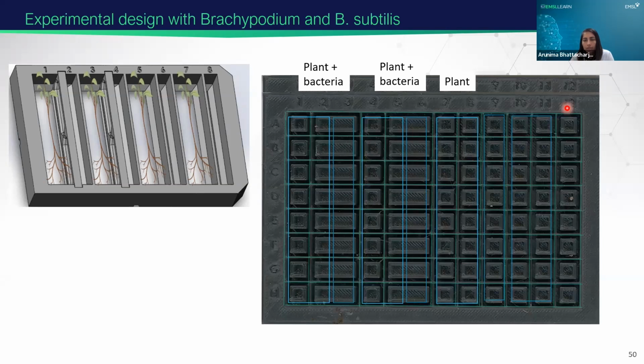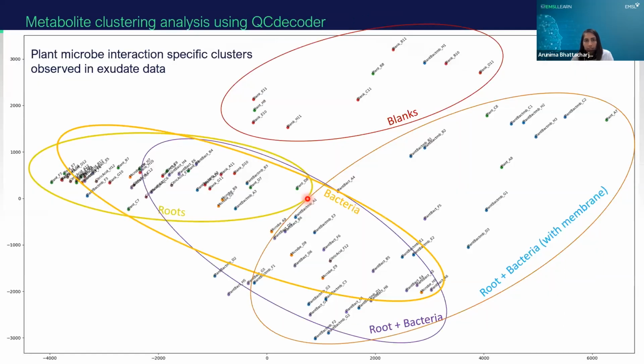And so we captured all of this inside of these capture plate wells. And then this plate was sent to the mass spec for analysis. And so we get a whole bunch of data. As you can imagine, there are so many different wells, and each well gives us thousands of spectra. And we have a workflow to analyze this data and represent it in a way that we can understand.